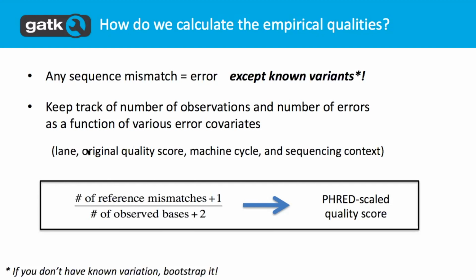The question here is, if you have a cancer sample with a much higher amount of mutations, is it possible that that starts introducing some noise? What we've seen, and we worked with the cancer genome analysis team on that at the time, is that for the most part we're still not seeing an effect of having more mutations in the cancer context.